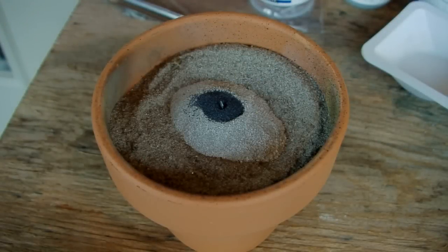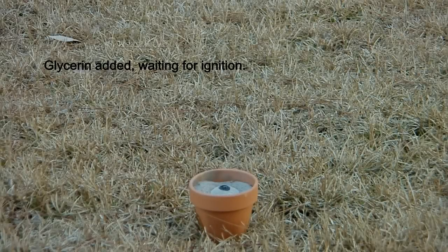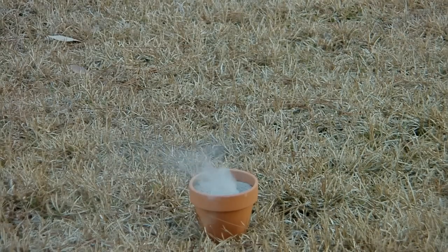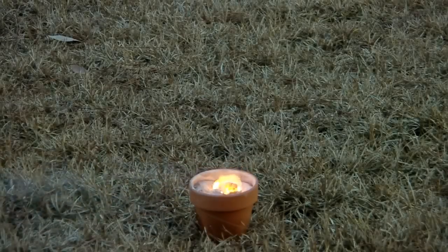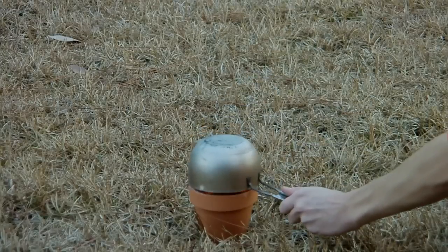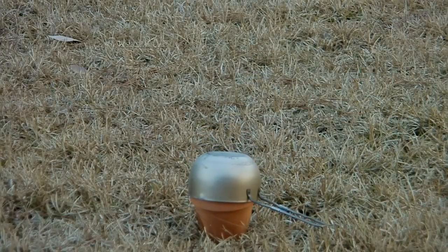Here's everything all mixed up and ready to go with my ignition method. I probably didn't really need to use the magnesium ribbon, considering the entire mixture is made of magnesium, but I want to give this the best chance of igniting because I really don't want to go through that whole crushing process again. The difference with this thermite is I'm going to have to cover it to prevent the boron from reoxidizing in the air while it's still hot, so I'll throw a pot over it when it's done.